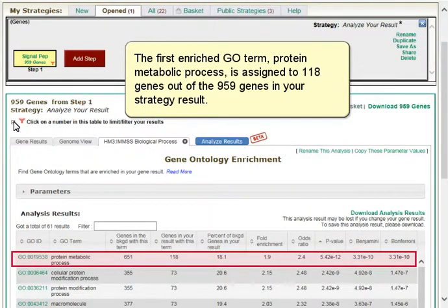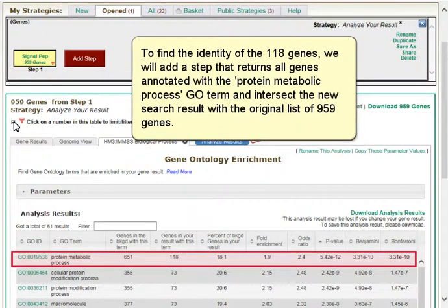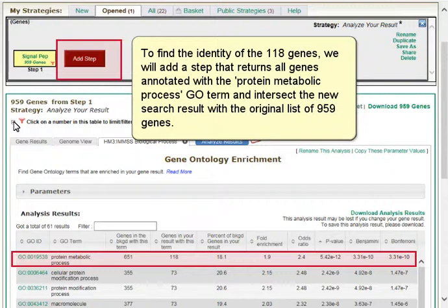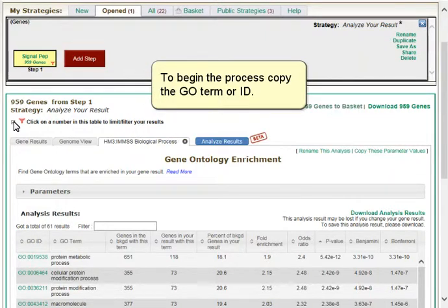The first enriched GO term, Protein Metabolic Process, is assigned to 118 genes out of the 959 genes in your strategy result. To find the identity of the 118 genes, we will add a step that returns all genes annotated with the Protein Metabolic Process GO term, and intersect the new search result with the original list of 959 genes. To begin the process, copy the GO term or ID.